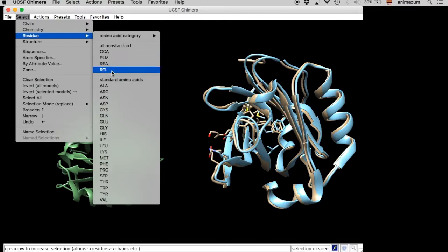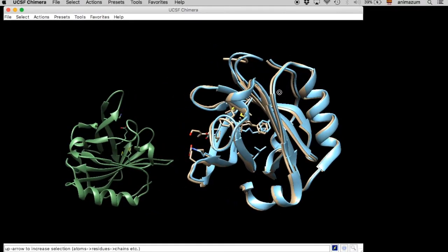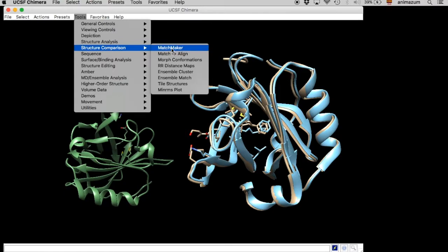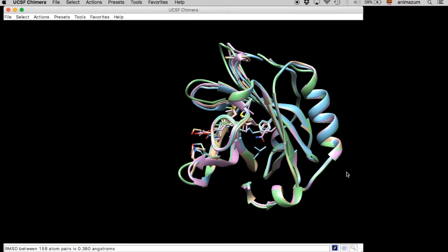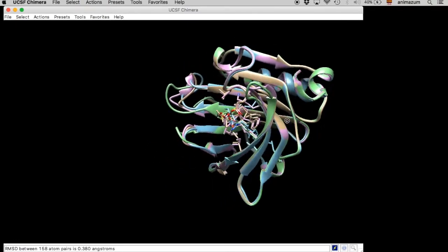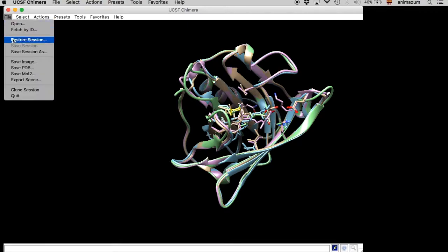Those were all — here are the ligands. Now we are going to align the proteins using the tool called Matchmaker, using the 1EXA as template with the default configuration. There they are, totally aligned. You can see that they are very alike. Those are the ligands in the middle, at the catalytic site.